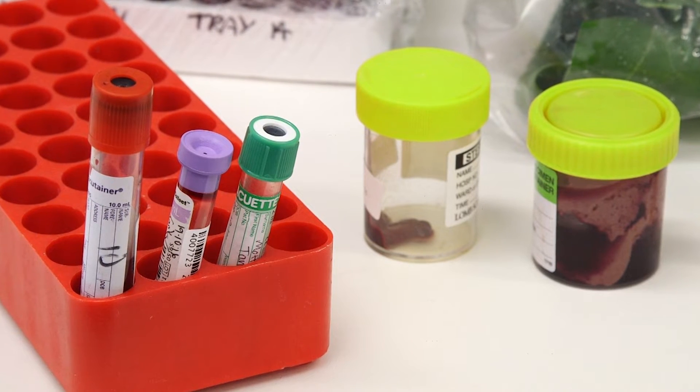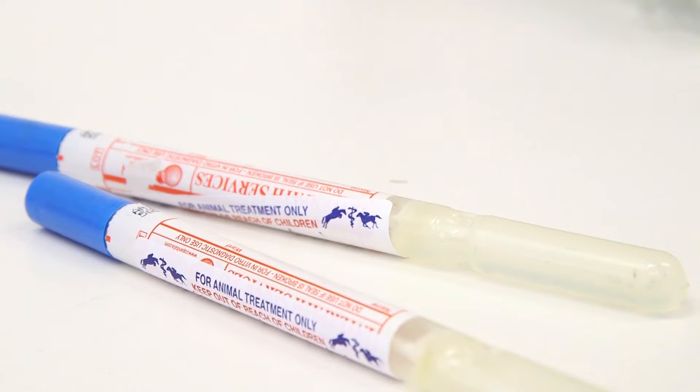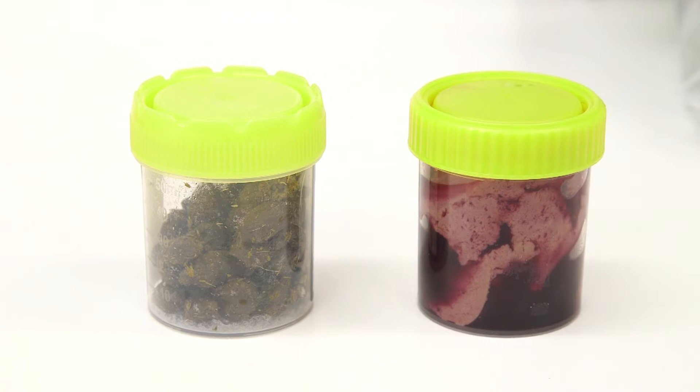Examples of primary receptacles include vacutainers for blood samples, swabs with transport media, and small containers for faeces or fresh tissues and zip lock bags for hairs or plant specimens.